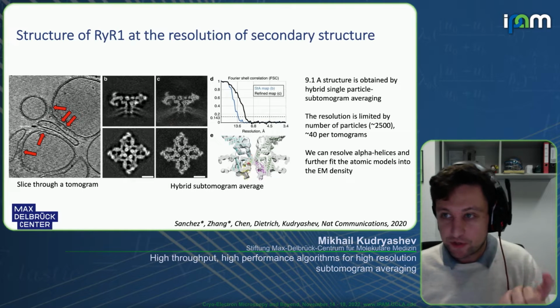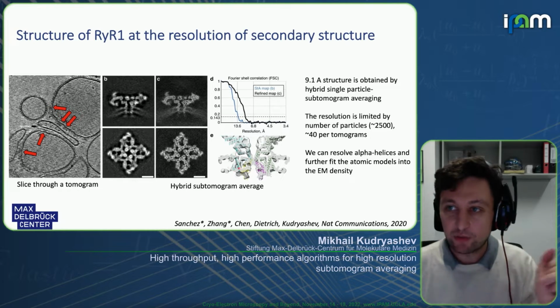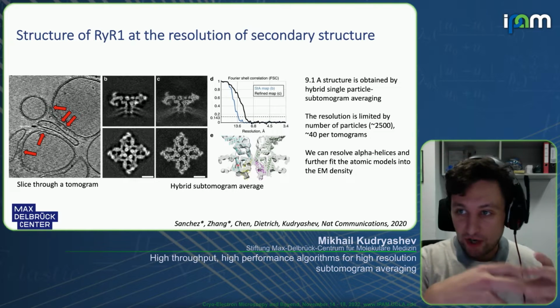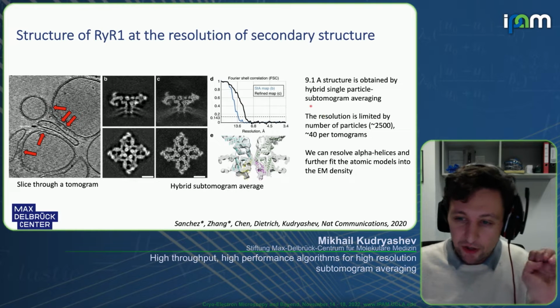And we can also position the high resolution atomic model. Then we can see that there is already a little difference between the structure of the purified receptor and the structure that is in the native membrane. We were very happy about the structure.